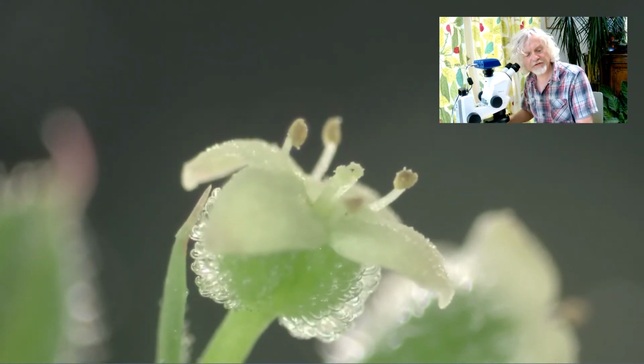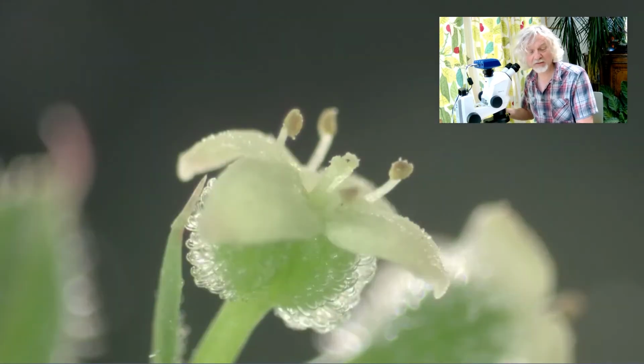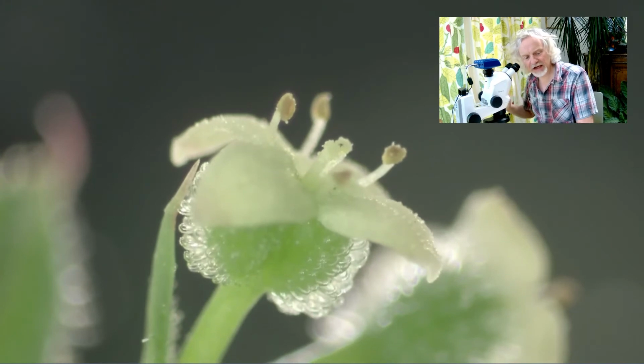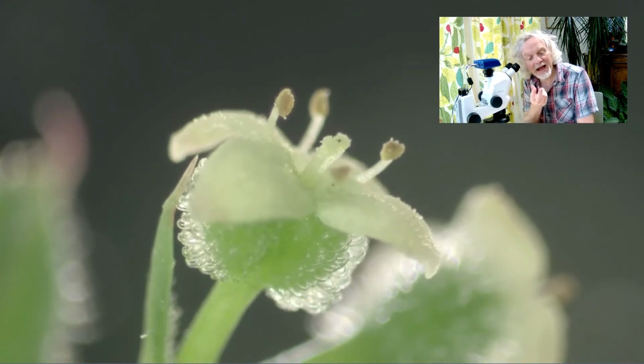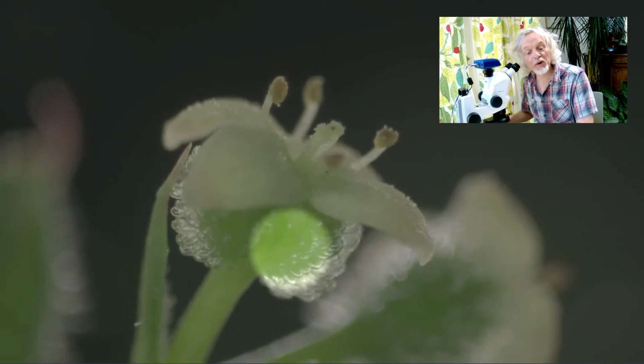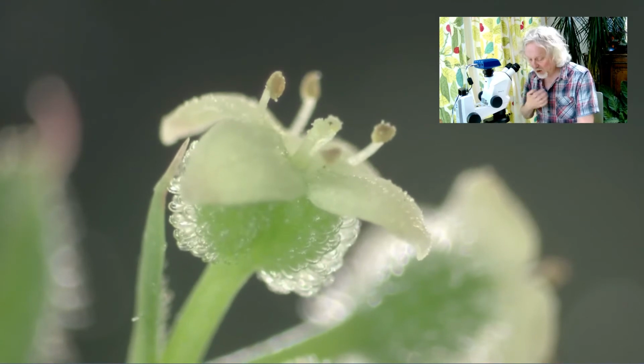So you've got the female stigma there. That's the centre of the flower, and this is where the pollen is. I've looked at pollen before. We've looked at pollen under the scanning electron microscope. That looks fantastic. And it's got these 4 tiny little white petals. And then underneath it begins to develop what's known as the burr. And once this thing's been fertilised, you get the seeds forming, which is where presumably some of its names come from.